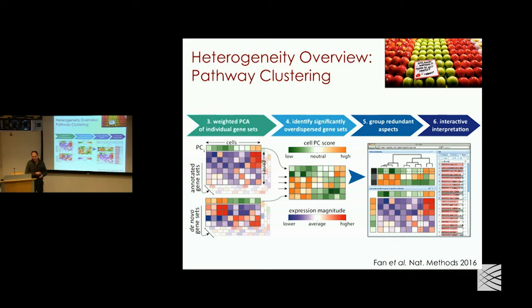And I think that's illustrative of the direction where we're going. We're trying to move away from gene sets into essentially just prior experiment-based annotations, because I think they bring more information than the simple gene sets we're able to manually curate. Just more unbiased, data-driven. Yeah. So I'll show some examples. And please, one more question.